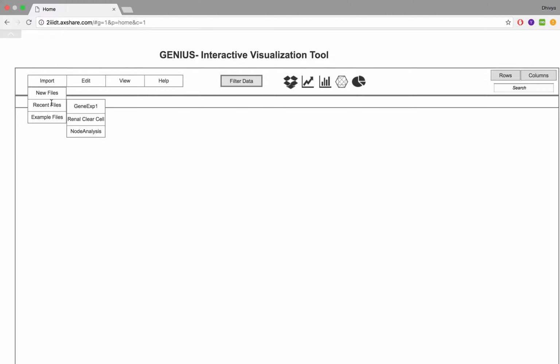Here, if you see, there will be only three types available, but in the Gene E tool, there will be several options, and that is always a cognitive load for the users because the system should take care of the extensions. The user shouldn't be taking care of the extensions they are using and should just select that particular file. So here the system behind the screen will take care of the extension the users are importing.